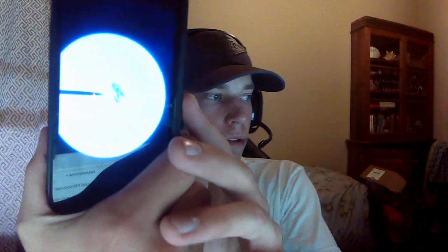One minute. Let me find it real fast. I had these all saved, but for some reason, the spirillum isn't coming up. I apologize. Okay, here it is.